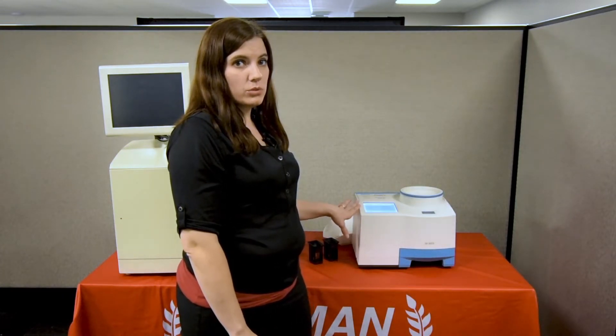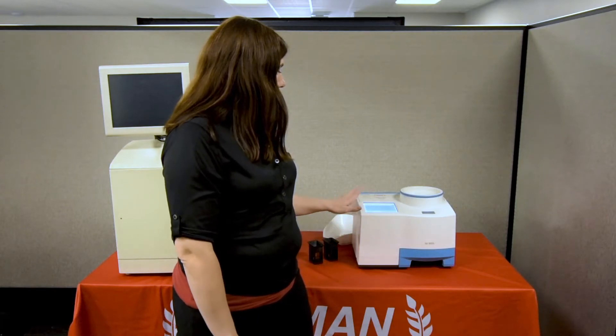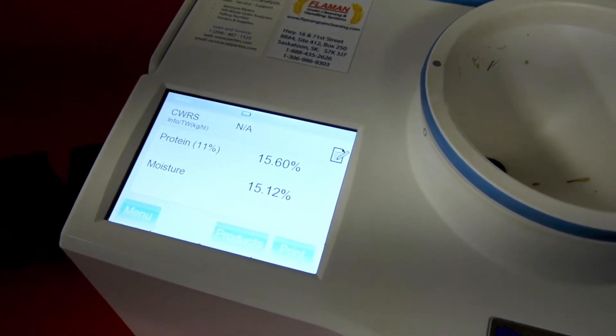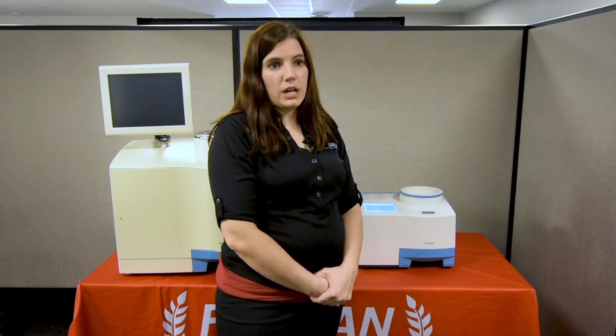If you know the test weight or any other information you want to put in for the grain, it can be entered when you do the test. The machine will display protein and moisture. You can hook it up to an external ticket printer or download all the results onto a USB.